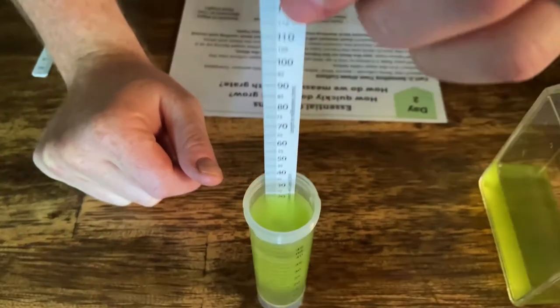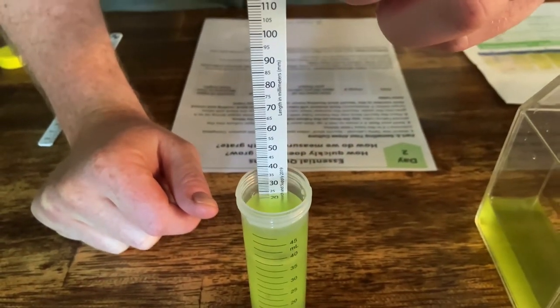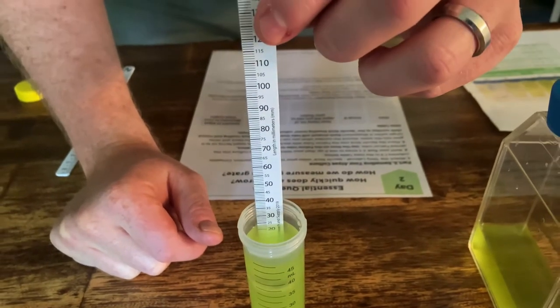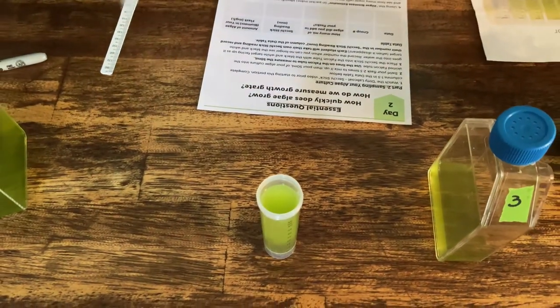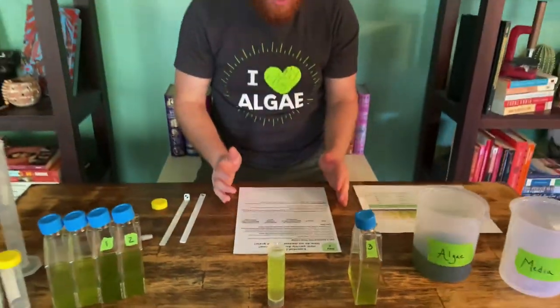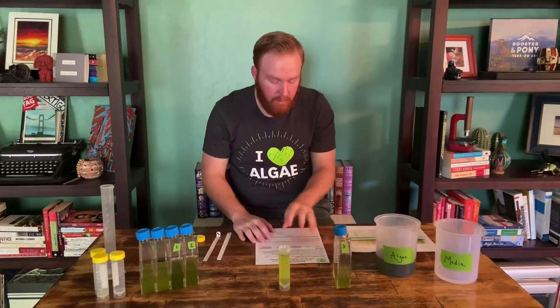It looks like it's disappearing right at about 20 millimeters. So 20 millimeters. If we had our worksheet, we would write down 20 millimeters so we know what it was.